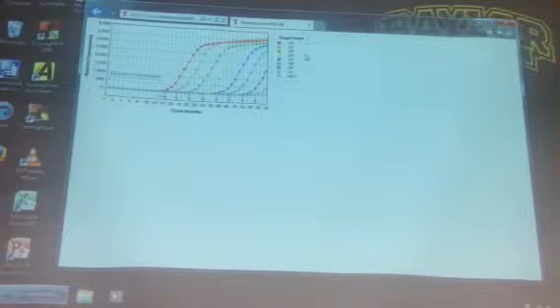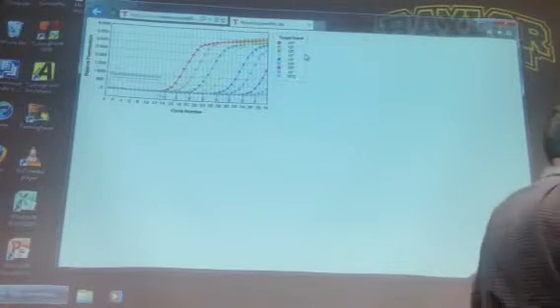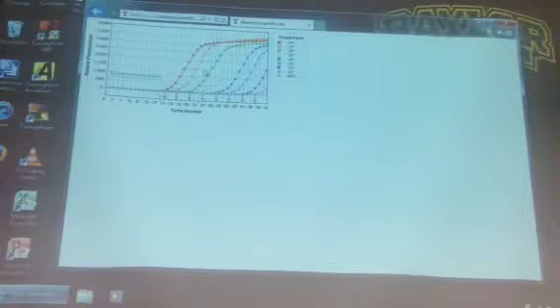So what they did instead is they invented a machine that has, in the PCR, the place where you put your tubes. Underneath each place which had the tube, they put a detector which would detect fluorescence. So you can keep track of the fluorescence of every tube automatically. In these qPCR machines, every tube is tracked for fluorescence, and you wind up coming out with a diagram like this.